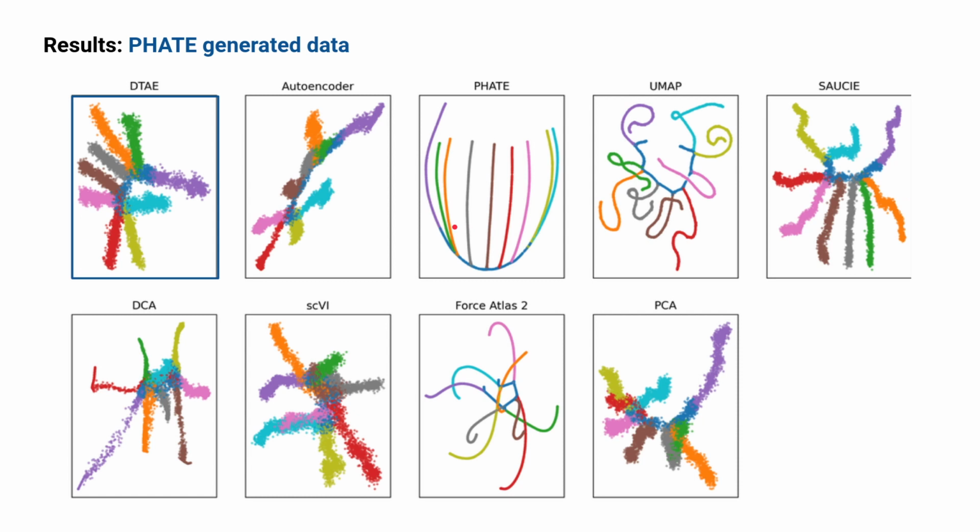This might make the interpretation easier, but the issue is that the data has some variance to it. It's not a thin line, it has some variance, which is what we see with PCA. PCA preserves the variance, so it is a good way to show that we actually have some variance that we want to reproduce. And autoencoder-based methods will reproduce this variance because they are made to reconstruct the data, and so they need to preserve some of it in order to do this reconstruction.